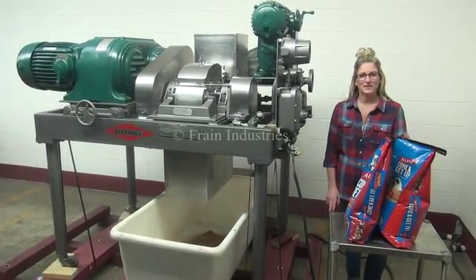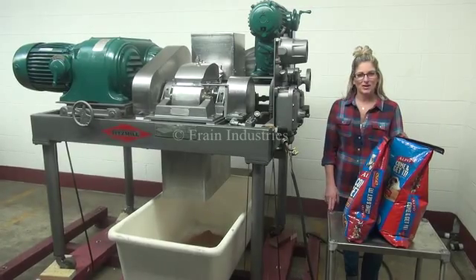Hi, I'm Katie with The Frain Group. Today we're cycling a Fitzmill Model U granulator.